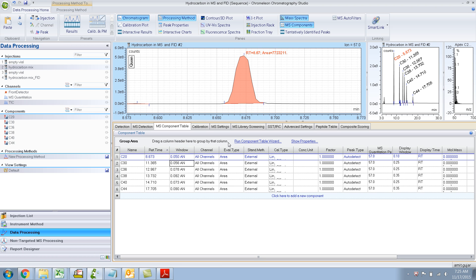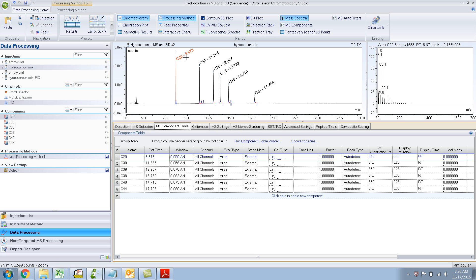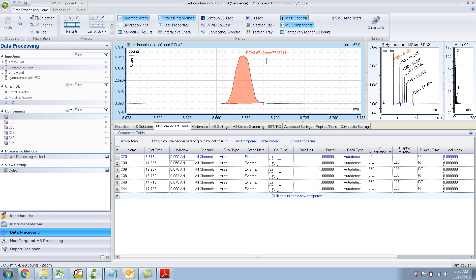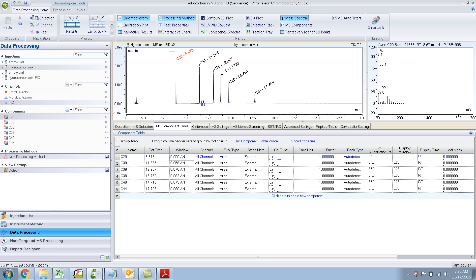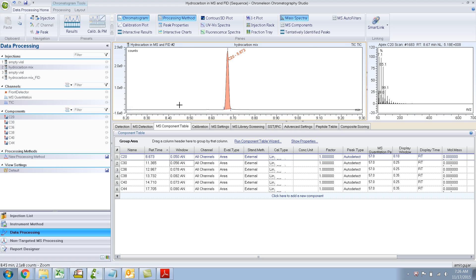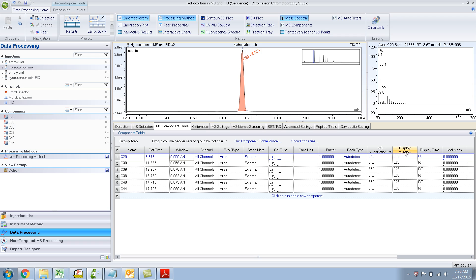Now it detects a peak. So maybe that was because the window at which it's looking for the peak was too narrow, and that's why it could not find the peak. Now you see it has detected the peak. When I click on MS Components, it shows you just the extracted ion chromatogram in this window. This MS Component pane is nothing but the chromatogram zoomed in to the display window of 0.1.